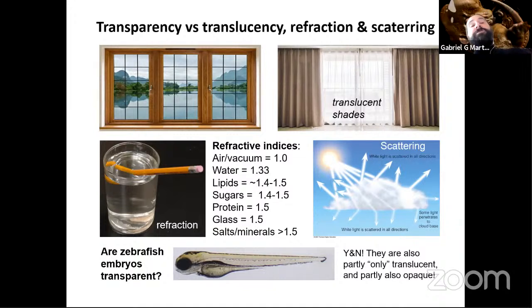But live biological materials are not made of glass. Even though purified protein has the same refractive index as glass, we're not an amalgamation of pure protein. Only a small portion of biological material is actually protein. So what happens to light when we're actually observing live, fresh biological material in microscopes? It's kind of like what happens with the sunlight when it goes through air and water in the clouds and it scatters all over the place. Scattering is this phenomenon of, if we know where the light is coming from, imagine for example a laser beam, and we know exactly how to describe its direction.